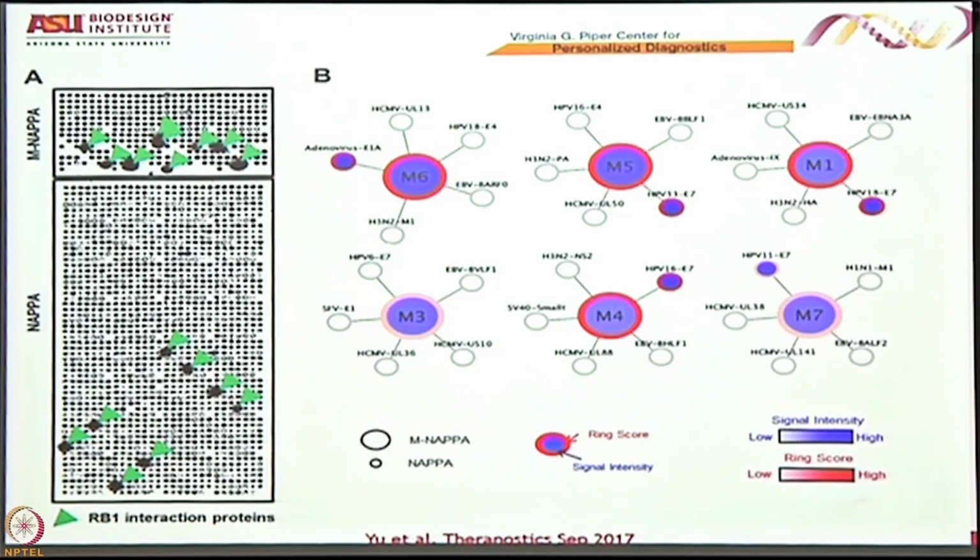Here's another one, and probably that protein is responsible for that. Here's one that was kind of weak, and notice that we don't see any of these 5 spots lighting up. So that becomes a little bit of a question mark. What would you call that? Thinking back to our statistics from yesterday, it's a possible false positive, right? The mix spot says there's a spot there, but when we went to confirm it, we couldn't find it. So that might be a false positive. We don't know. It could be that we just didn't get good detection here.